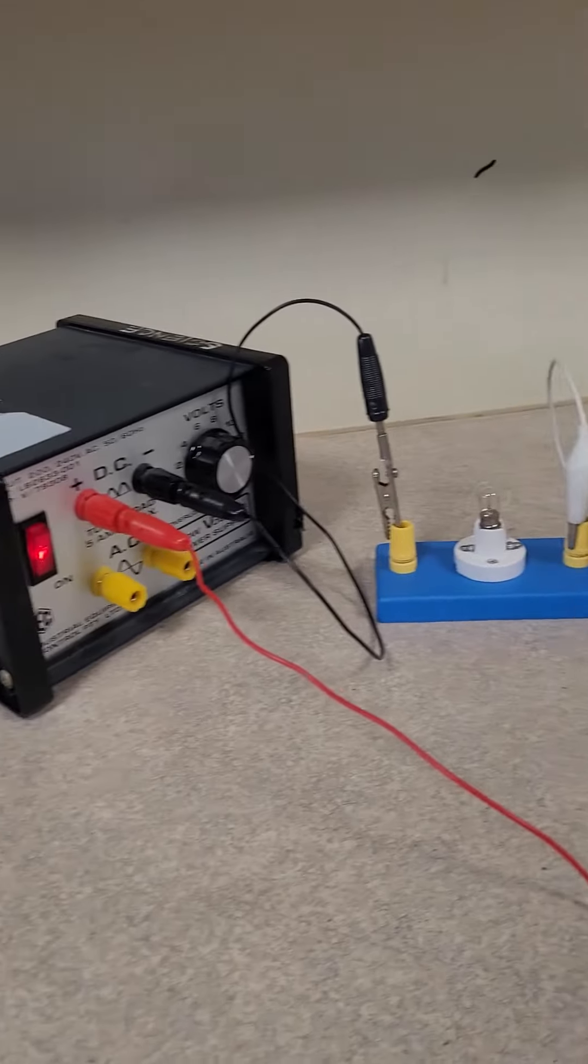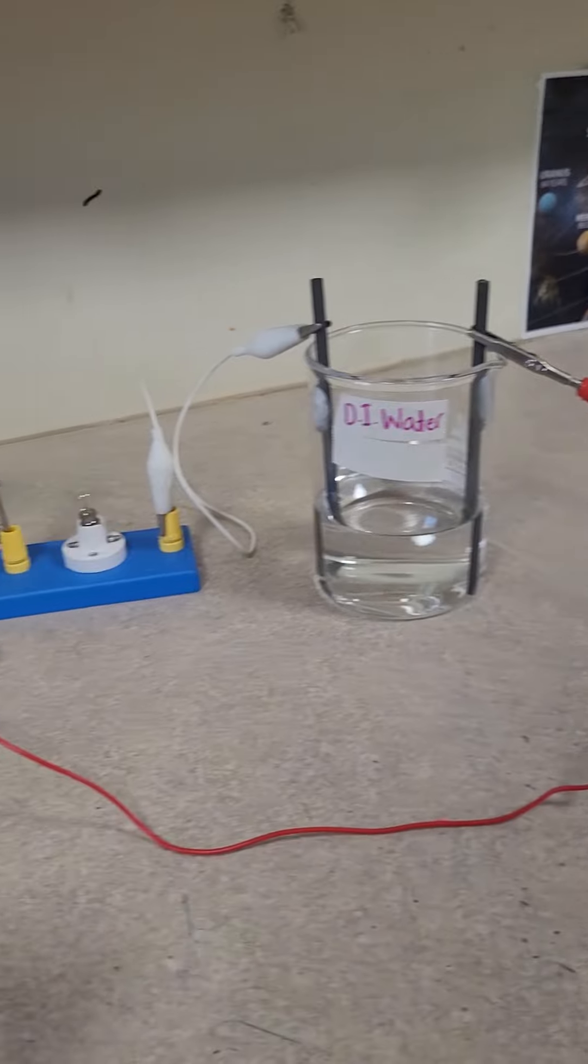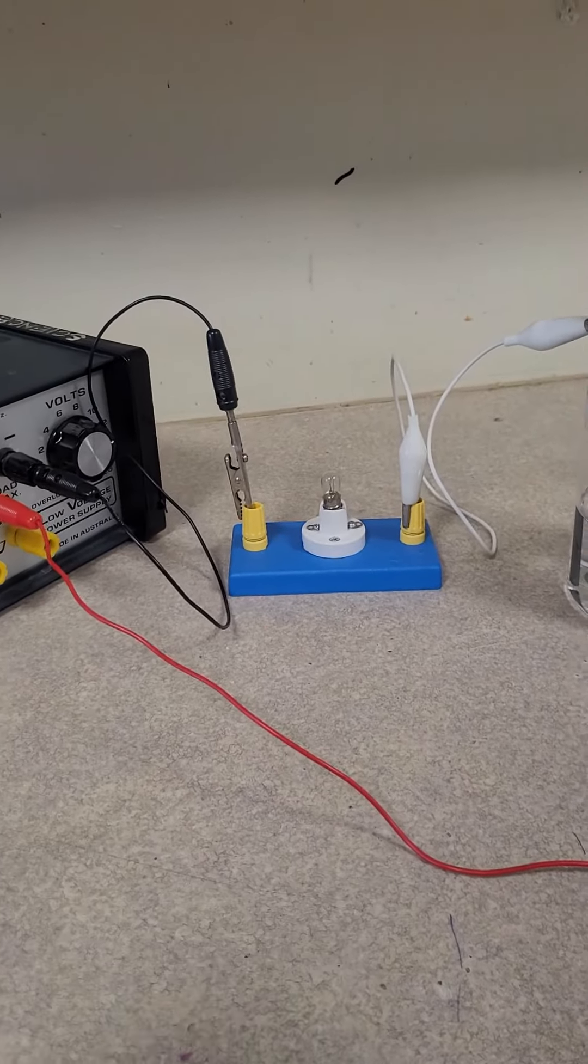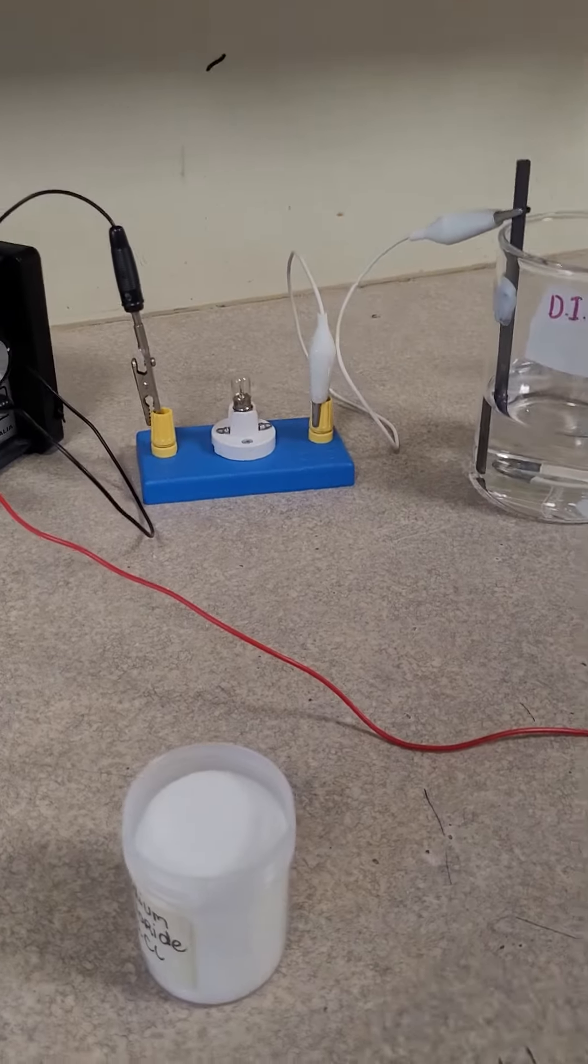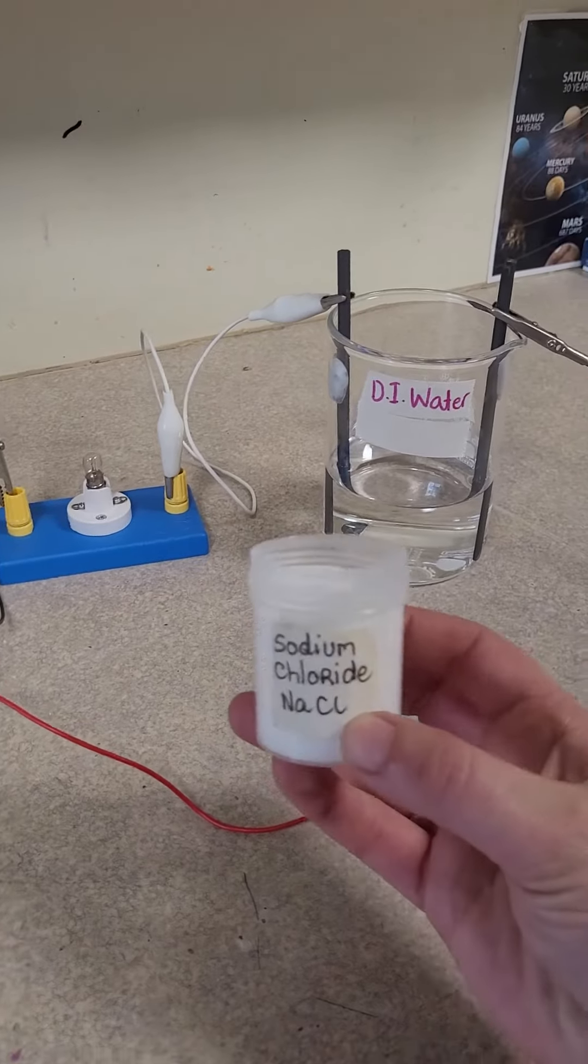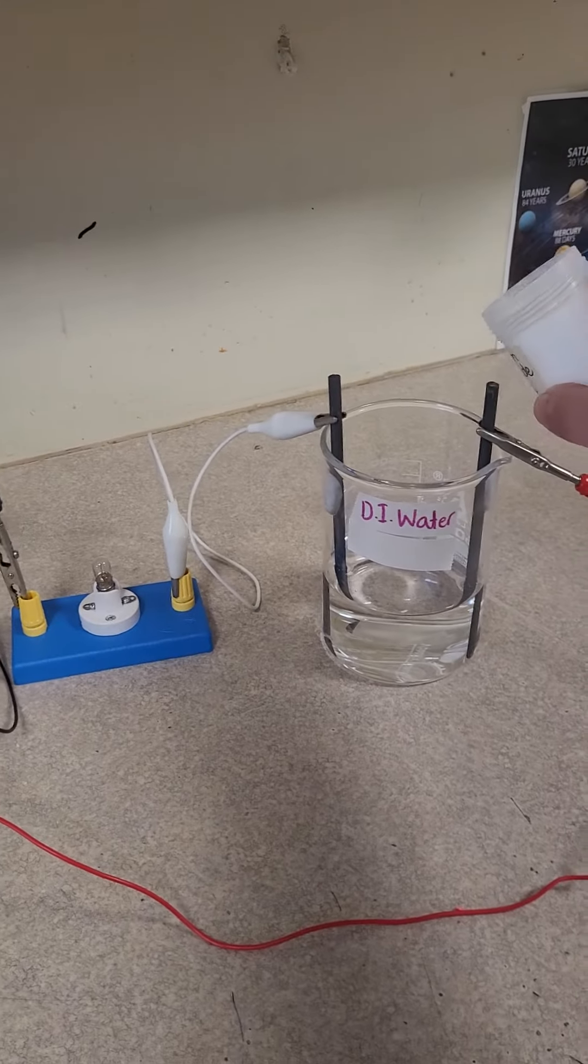Okay, so we have the circuit hooked up to the water. Still no light globe. What if I try and put some sodium chloride into the water and dissolve it?